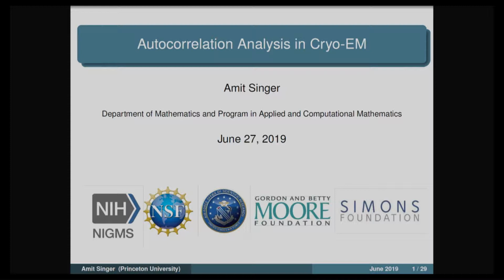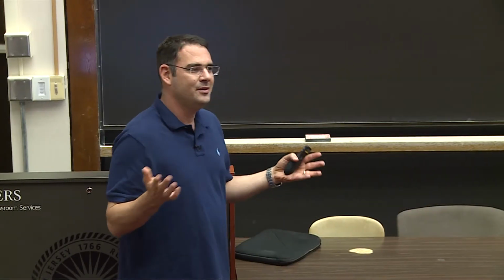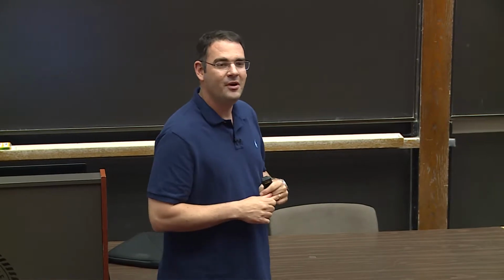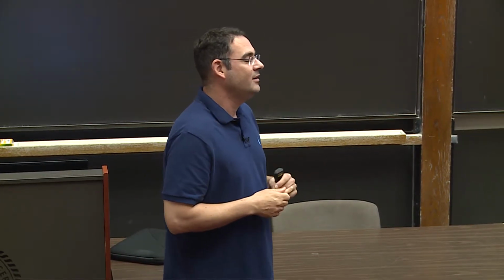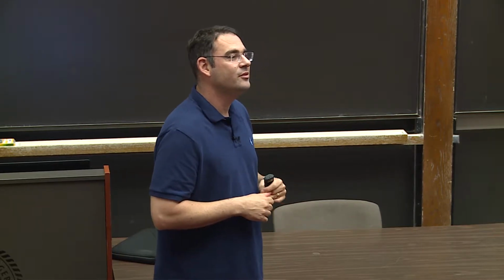So I'll be talking today about Cryo-Electron microscopy and in particular autocorrelation analysis to solve CryoEM. And so you may wonder, how does this relate to distance geometry? Perhaps many of you here have not heard about CryoEM. CryoEM is a method for finding three-dimensional structures of molecules.